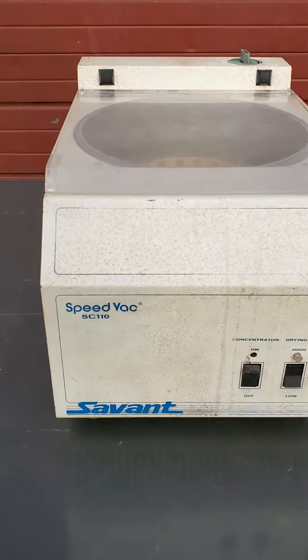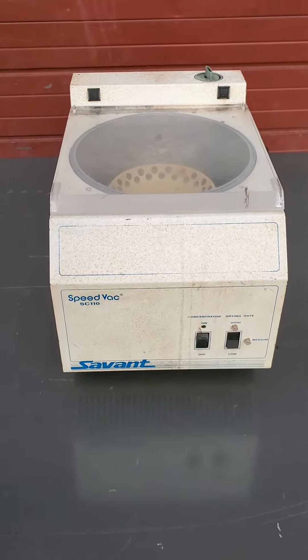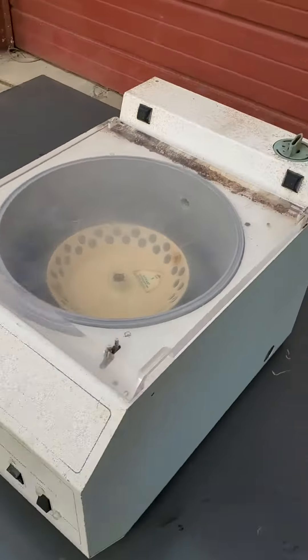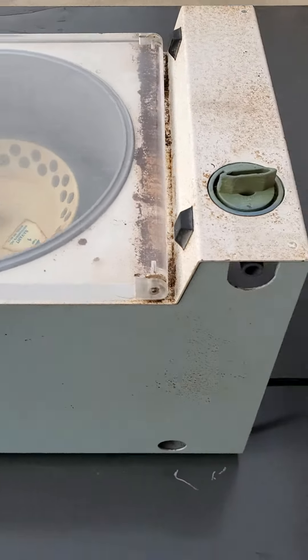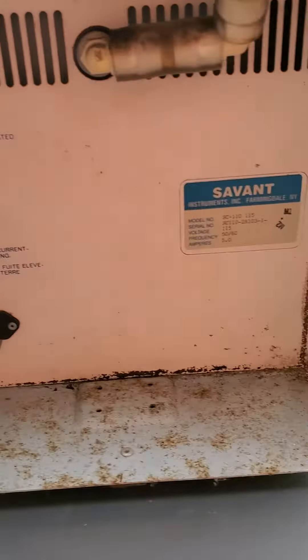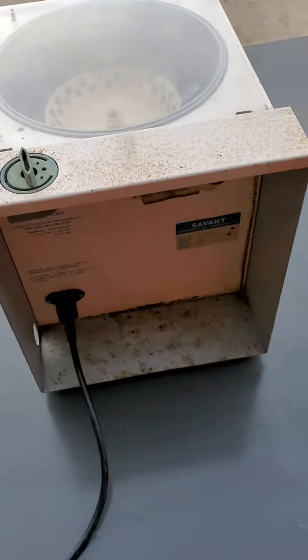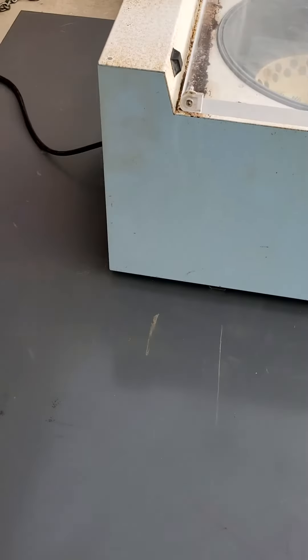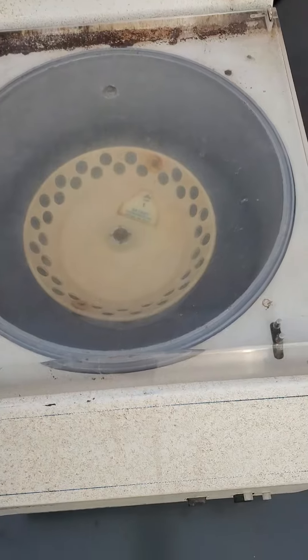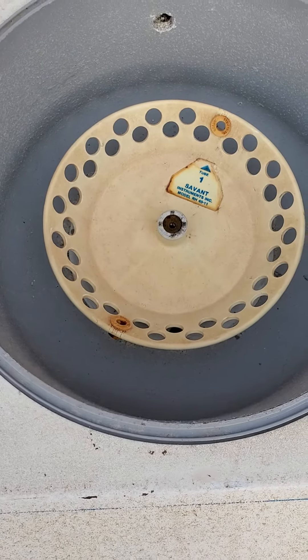So here we have a Savant SpeedVac SC110. It's an oldie but goodie — works perfectly. There's nothing wrong operationally with it. It's got rust spots all over it, but operation is perfect. And that's why the price is so good — such a great price for an excellent operational condition Savant SC110.